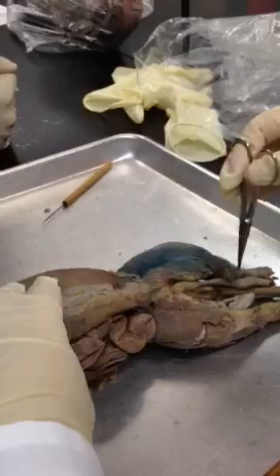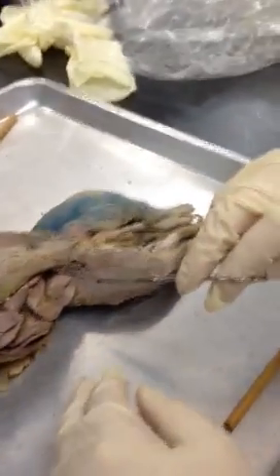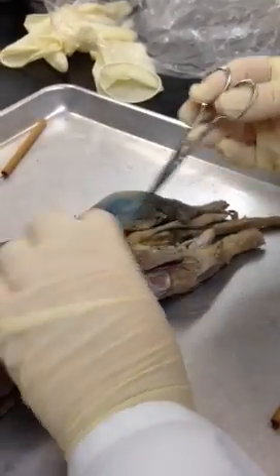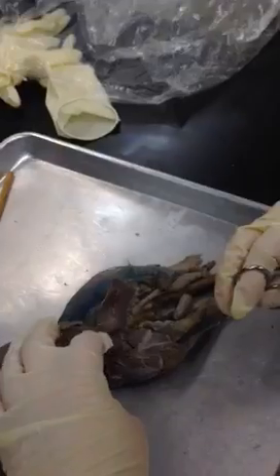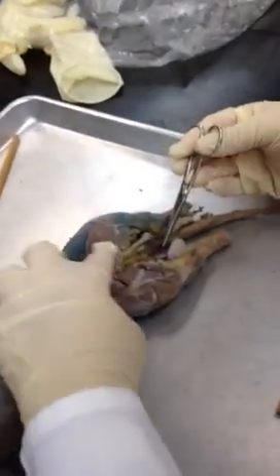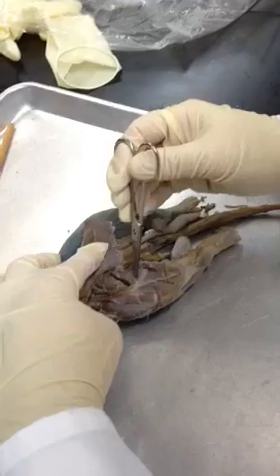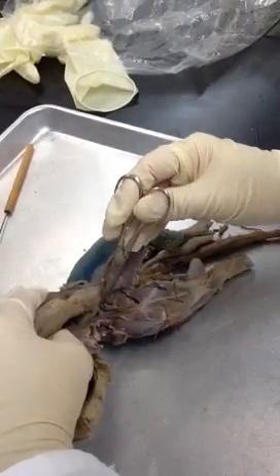On the thigh here — get the testes out of the way — first, two muscles we're going to see: sartorius and gracilis. Pull these back now, and this is what I was trying to show you before. So now we can see all the muscles intact, kind of the way they're supposed to look. Semitendinosus. Semimembranosus. Adductor femoris or magnus. Right here is adductor longus.